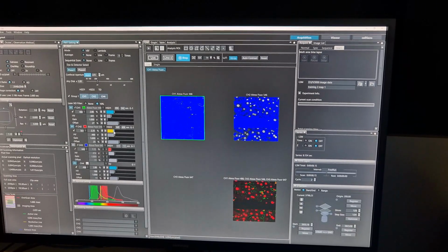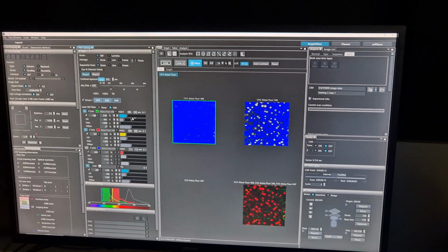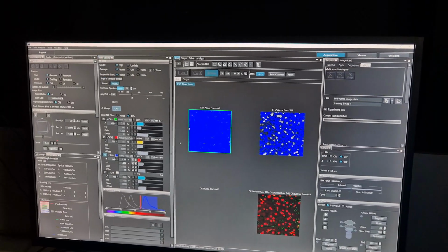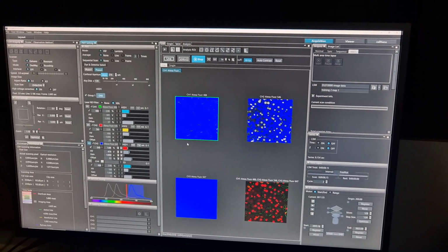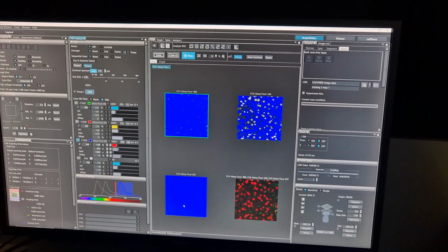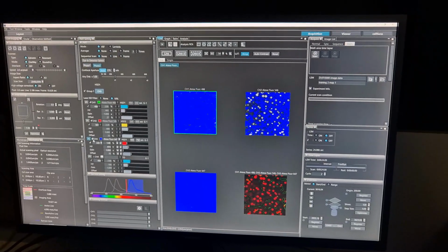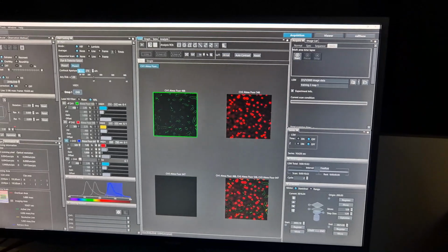Just going up and down, seeing if there's any bright spots. And it's fine, then we're going to go to phase 2. Check this one. So this one, I don't think there was much. It's sort of not as continuous as the label, whatever it was. So it might not even be anything here in this particular field. I'm going up and down right now and I'm not seeing anything. Alright, so maybe we save some time and forget about this phase altogether for now, and we'll go back and skip this off.